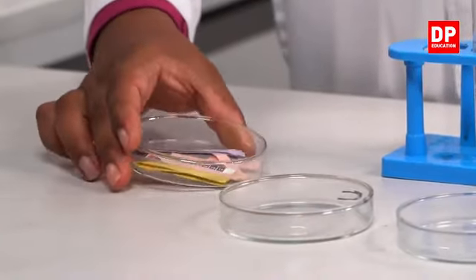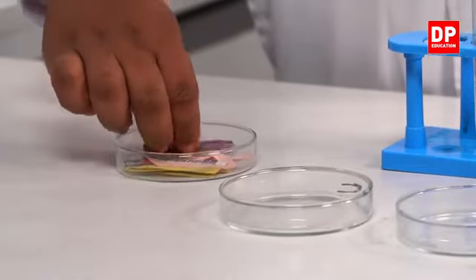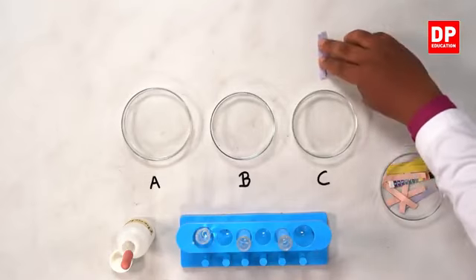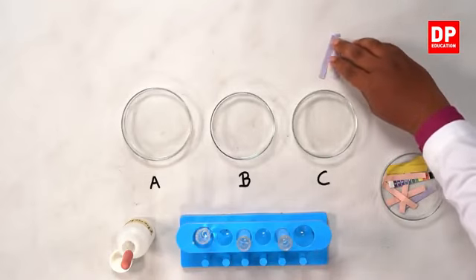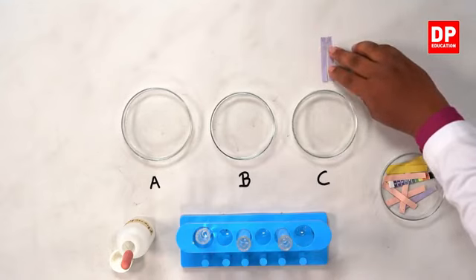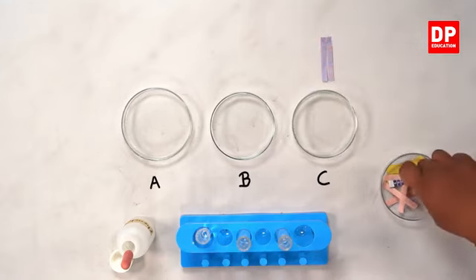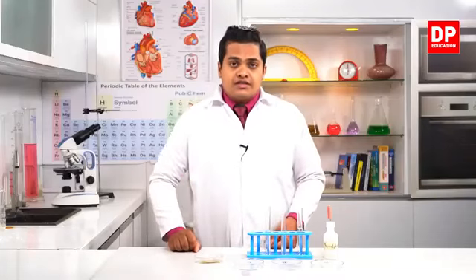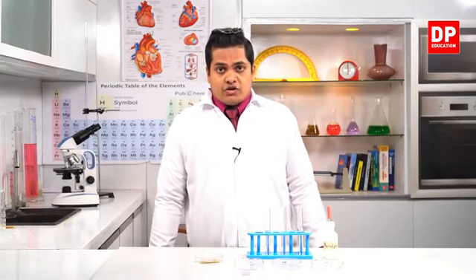First of all, I have pieces of paper which are in blue color, right? These pieces of paper which are in blue color are referred to as blue litmus. You already know these things, blue litmus. In the materials also, I told you when I was doing the activity in the classroom that for the materials we'll be needing these litmus papers.